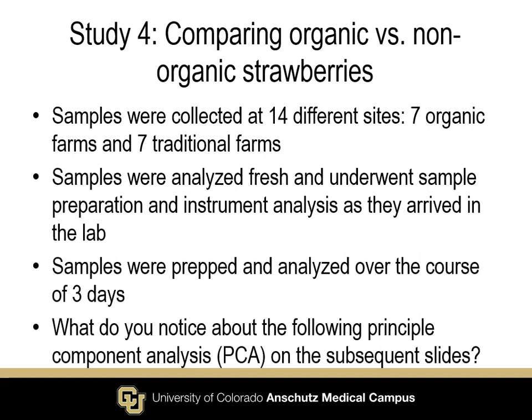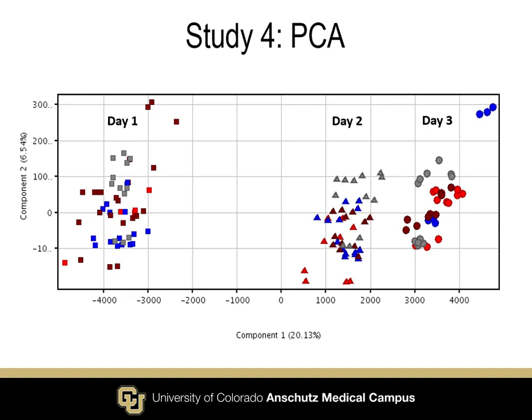Instrument analysis was done, and then we did a PCA on the resulting data. And can you see anything here, based on the day that they were prepped and analyzed, that would be a concern for any project? Batch effects.